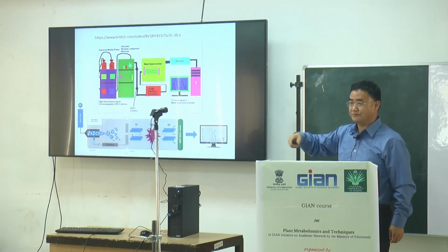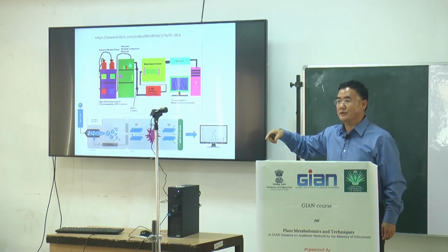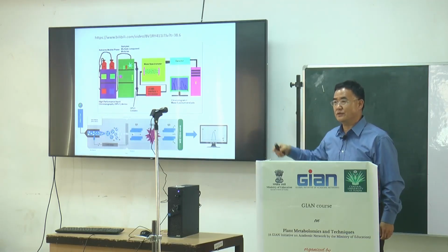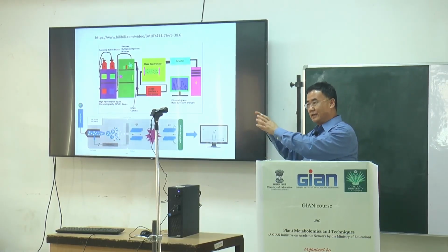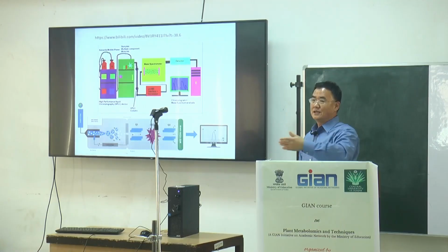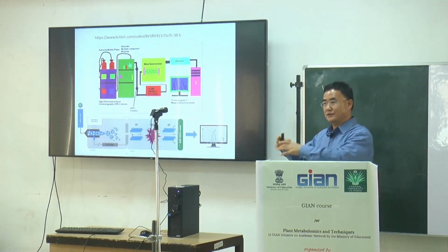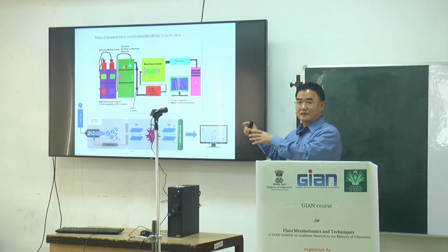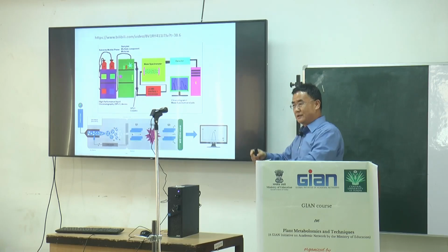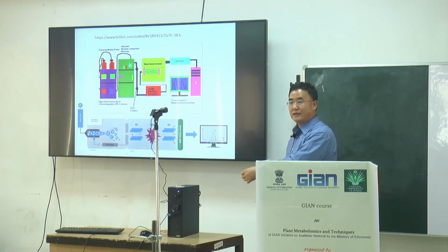For example, from this plant you find some new compound you don't know. Sometimes you don't need to isolate this compound specifically. You can use preparative HPLC with a very big column, load larger amounts of sample, then quickly separate and collect with very high separation efficiency.